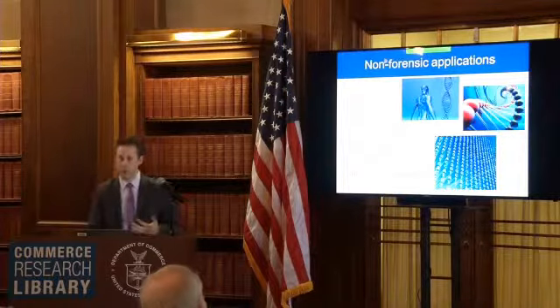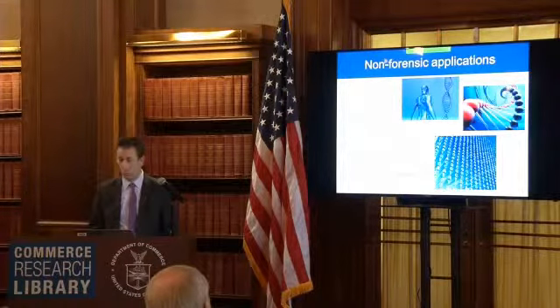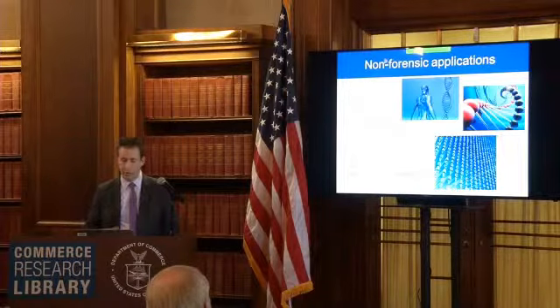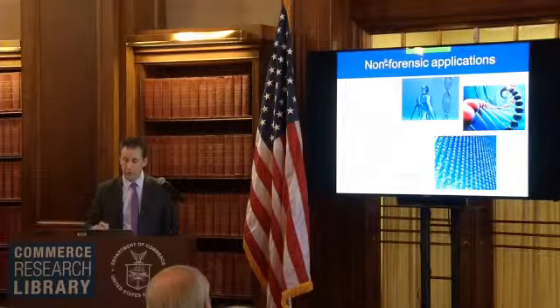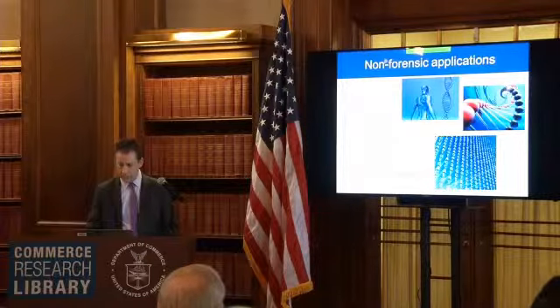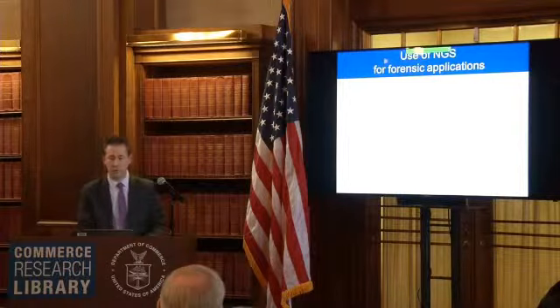So, looking at clinical research, inherited disease, these are some of the questions that can be addressed with next-gen sequencing in a research setting. Looking at cancer, rare variants, transplant medicine, this level of sequencing opens up a lot more areas in terms of applications of DNA typing or DNA testing. I'm not going to get into these too much, but for my purposes, what would be the application for forensics?